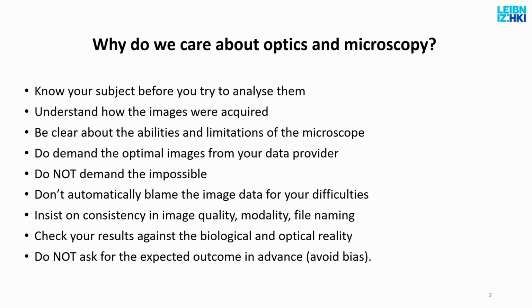And then you will say, okay, I am going to resolve my nuclei, so my resolution has to be such and such, but I also want to see actin filaments, so my resolution should be higher, because I know that otherwise I will not be able to quantify them, I will not be able to measure the length of the actin filaments, and so on and so forth. But if you are only looking for nuclei, you will also know, okay, I don't need to see 100 nanometer detail because it's a big object, it's a big nucleus. Why bother? Why waste my time, energy, labor, and money when I don't need it?